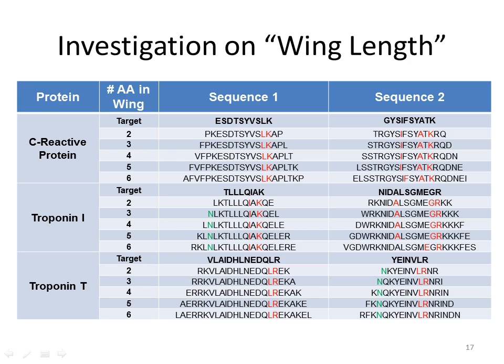Right, and we had to make some extra modifications. For example, this asparagine is not really an asparagine in the protein sequence, it's a glutamine, but glutamine, I believe, has the capacity to cyclize when it's at the N-terminus, and we didn't know if this cyclization of a glutamine would affect the cleavage, and we were just grasping at straws a little bit. But in each of these 3 cases, we definitely had these proteins.